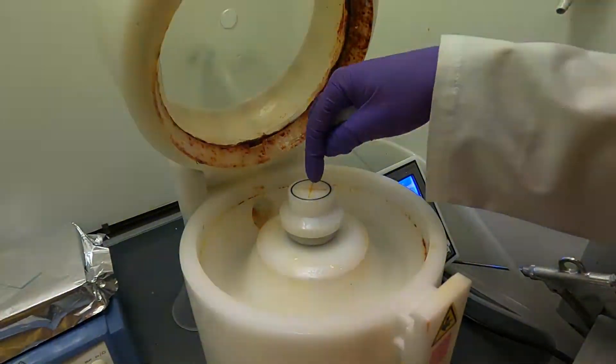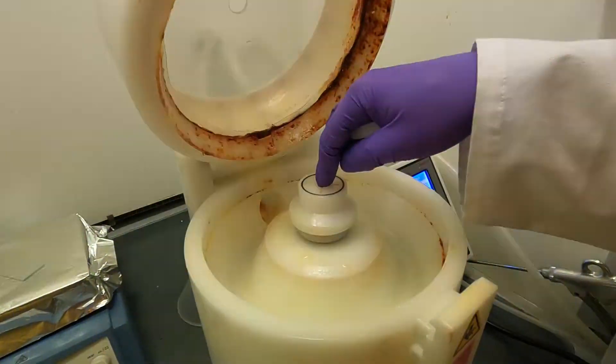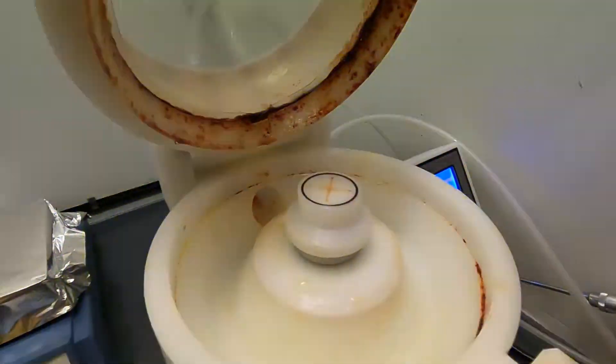The way that the sample is attached to the chuck itself is through this hole here which is connected to a vacuum pump which we have below the bench.